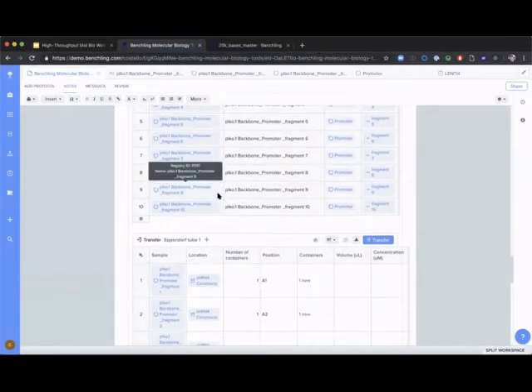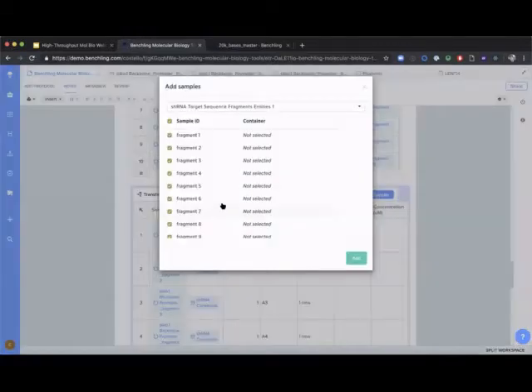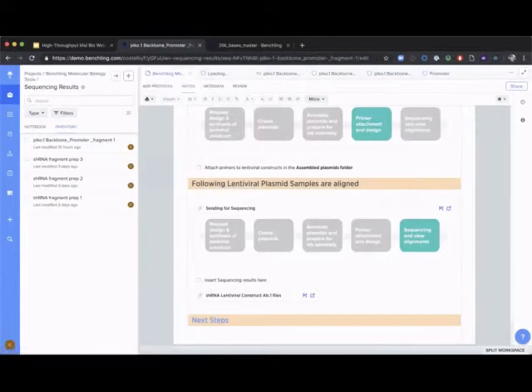Actually, Benchling's inventory application integrates with the molecular biology suite and the registry as well. So I can use something such as a transfer table, which is an extension of our inventory application, to directly add the samples that I've recently created. For example, the plasmid entities: understand which sequence you've made as your template, and it will create the alignment for that particular template and save that alignment to the template sequence.